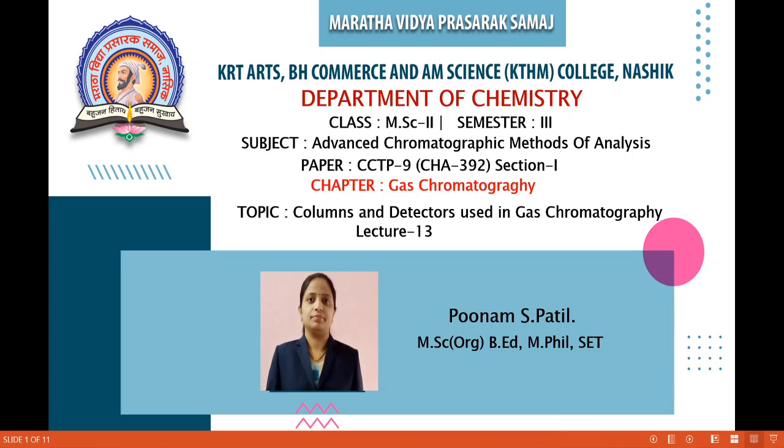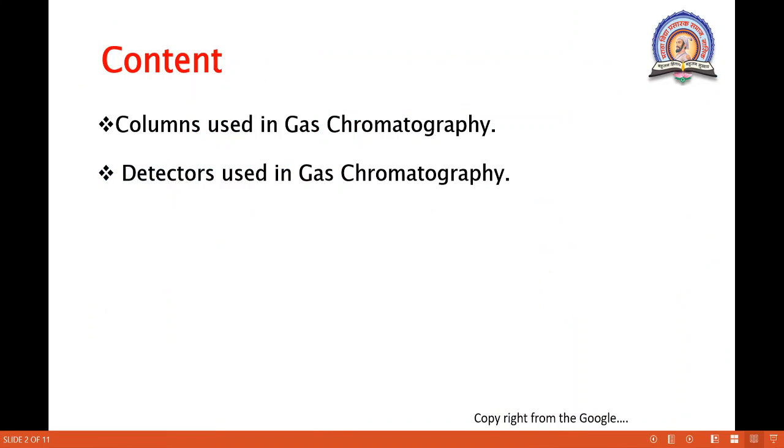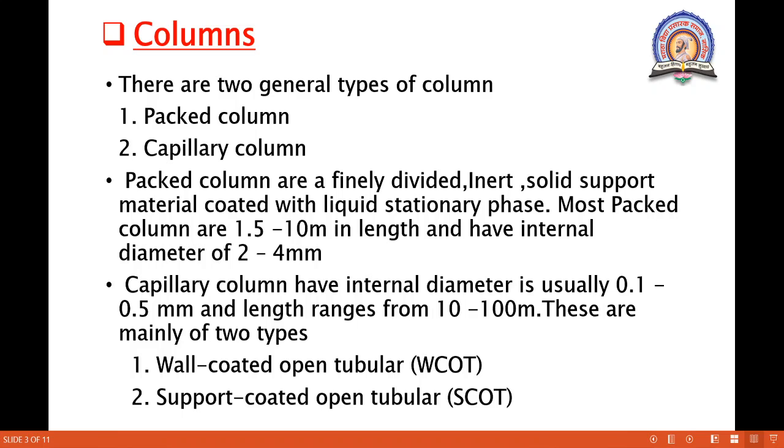Now in today's lecture we will discuss the remaining 2 components, that is columns and detectors, which are used in gas chromatography. So the content of today's lecture is the column used in gas chromatography and the detectors used in gas chromatography. So first we proceed through the columns.